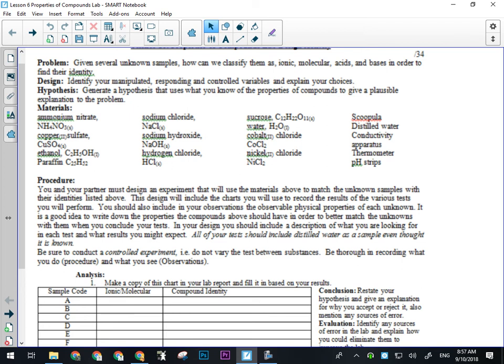Okay, so controlling it, like the one we had there was different amounts of materials. Well, we want to have the same amount of each material. Why is that important? Well, if I had way more of one thing, it might look like it doesn't dissolve in the solubility test, and I had like 2 grains of this other thing, and it dissolved right away. It's not really a fair comparison. Things like that. So this is how it would affect the experiment. I'm controlling it by making sure I measure it out or whatever.